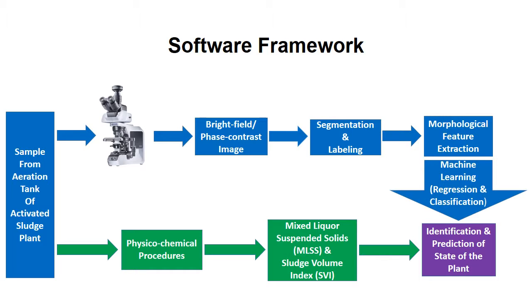The images were segmented and labeled, and morphological features of flocks were extracted. Machine learning algorithms were used subsequently for identification and prediction. For benchmarking, traditional physicochemical procedures were used.